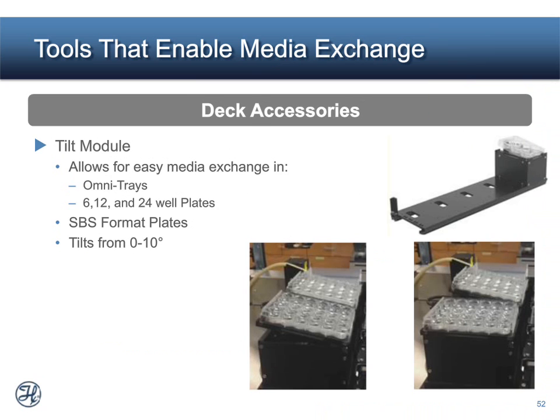Also, when passaging or exchanging media in a cell culture vessel with cells, oftentimes manually in a hood, you manipulate the labware and tilt it so you can remove all the media or exchange it. And we have offered, or other companies, to look at what they have to offer, but in terms of being able to tilt the labware so that we can exchange media and completely remove it out of the labware, or when you're passaging cells, it's important to get all of the cells out of the well. And what type of labware it's compatible with.